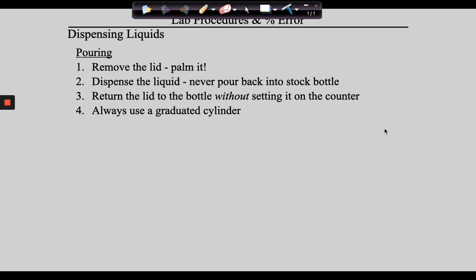Then you're going to come along and get the liquid that you need, but what if you get too much? What do you do with the extra? What don't you do with the extra? Never pour back into a stock bottle. Guys, these are understood to be clean. If you do this, you don't know where this graduated cylinder has been and it's contaminated. Do not let me catch you pouring stuff back into stock bottles.